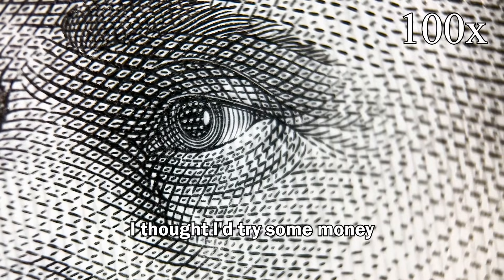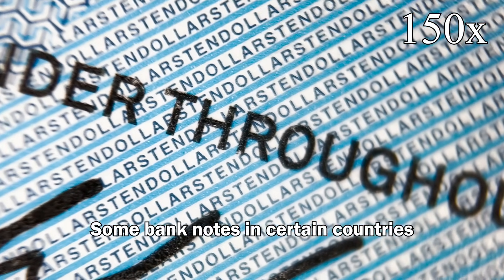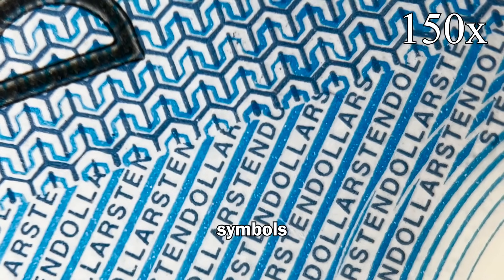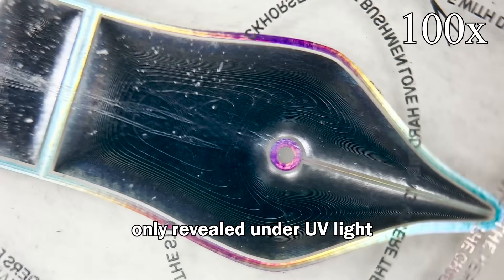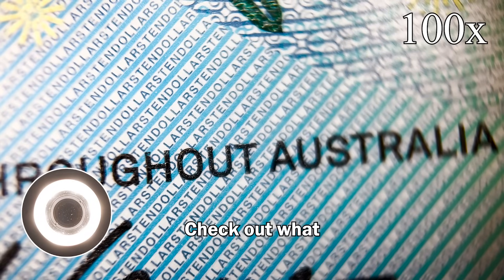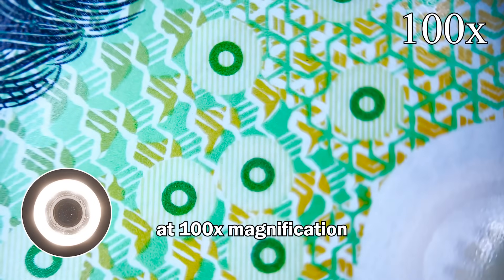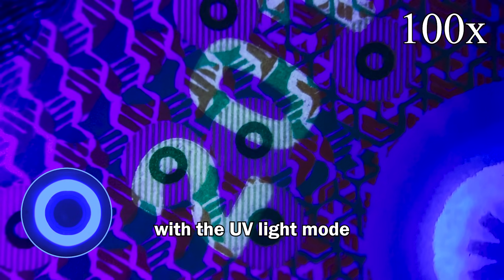Next up, I thought I'd try some money. Some banknotes in certain countries have microscopic letters and writing, and some have secret symbols only revealed under UV light. Check out what the Phone Micro 5 by Apexel reveals at 100x magnification with the UV light mode.